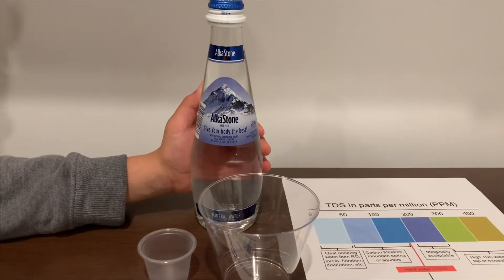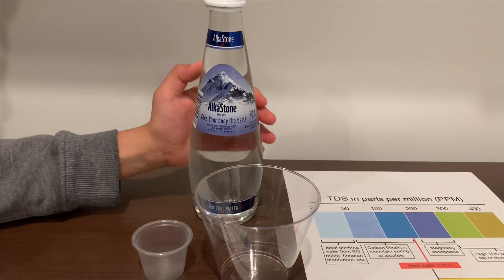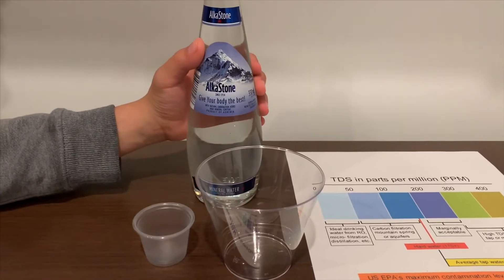This is Cusal natural mineral water. It costs 99 cents and it's sourced from Armenia. Let's test the pH and TDS levels.